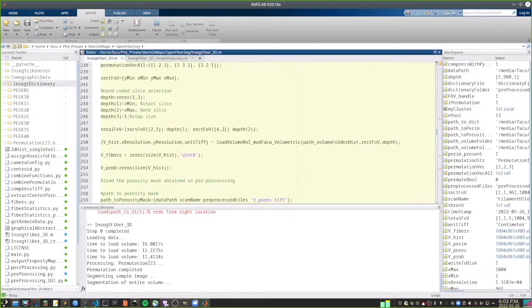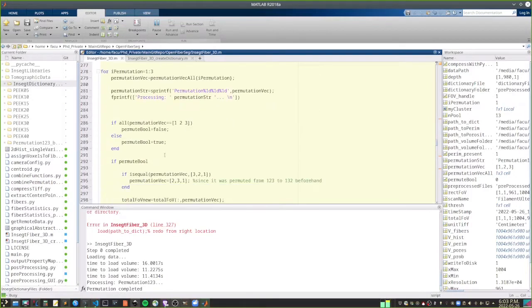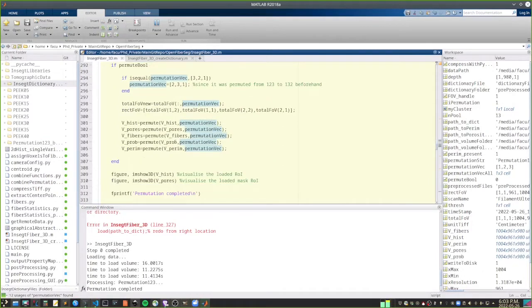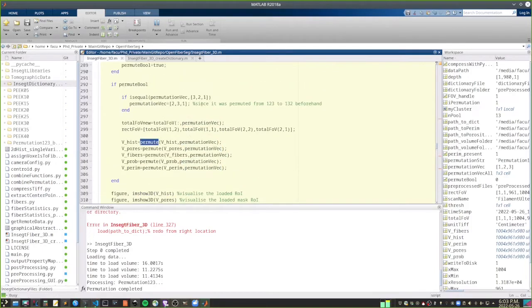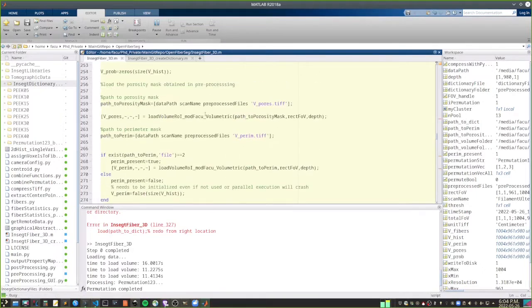And then it's going to be 1, 3, 2, and then 3, 2, 1. Basically, because the Matlab function that does this is called permutation. I forget. Yeah, permute. Permute is the function that does it, and the vector is like the order in which you use the things. So 1, 2, 3 is the first one, and anyway, you don't really need to. You won't have to mess with it, but it's a good idea to understand at least what it's doing.